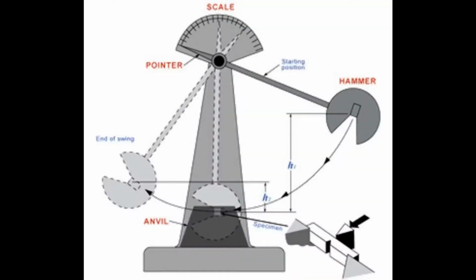There are two standardized tests to measure the impact energy, the Charpy and Izod. The Charpy is the most common one. The apparatus for performing impact tests is illustrated schematically in the figure.